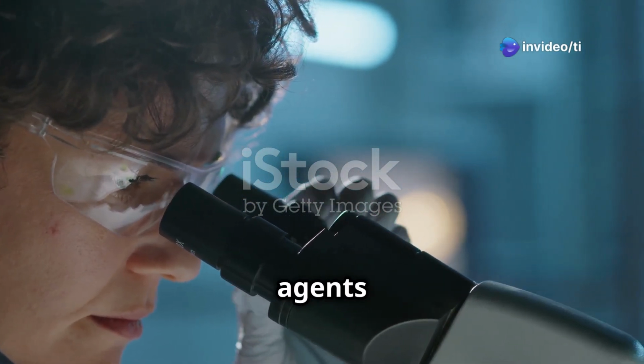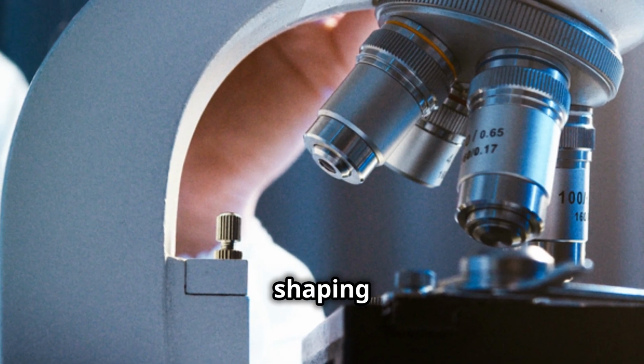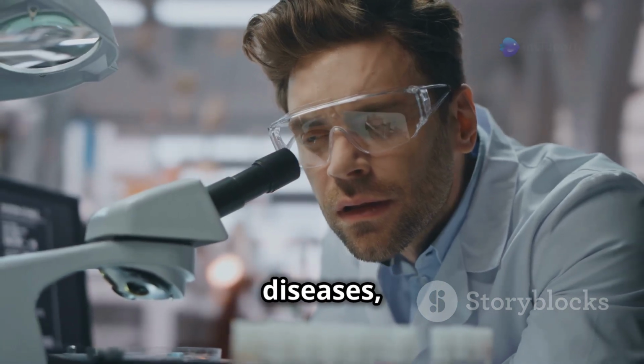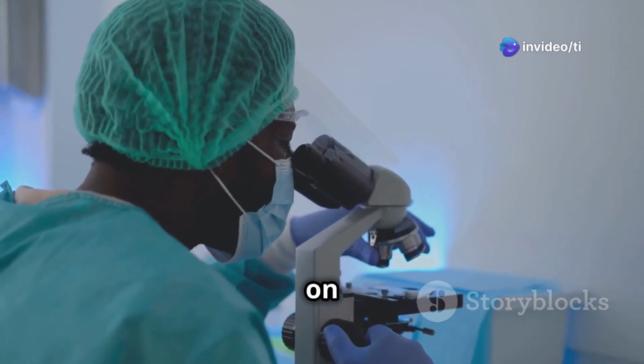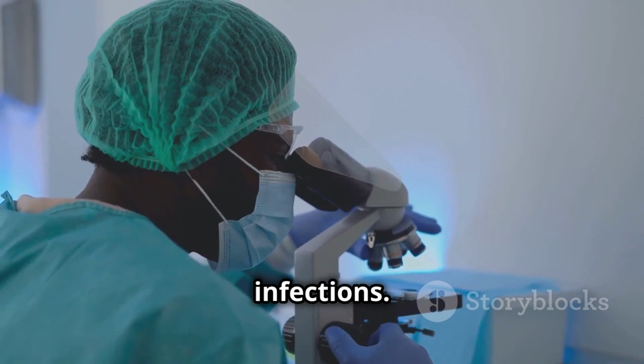Microscopes are like secret agents of science working behind the scenes in countless fields, silently shaping our world. In medicine, they are indispensable tools for diagnosing diseases, analyzing blood samples, and studying tissues for signs of illness. Doctors and researchers rely on microscopes to identify bacteria, viruses, and other pathogens that cause infections.